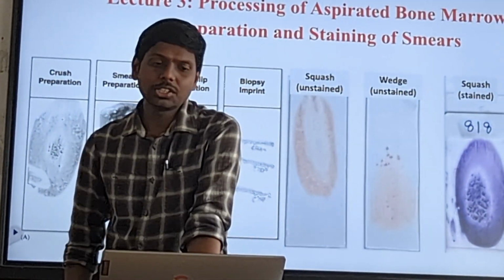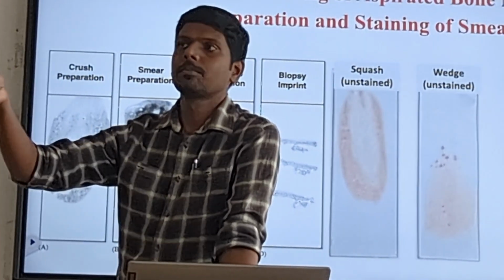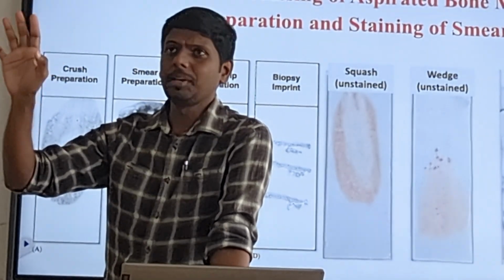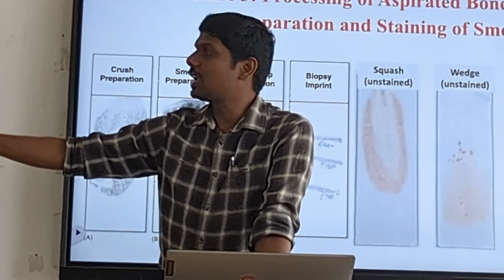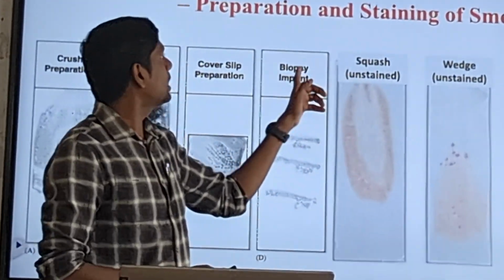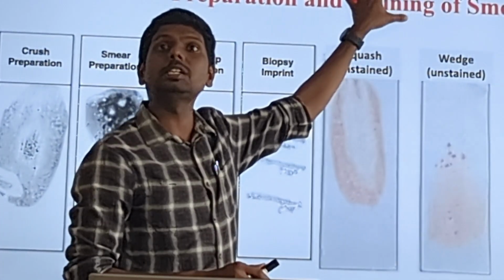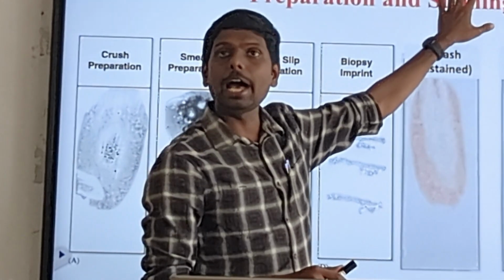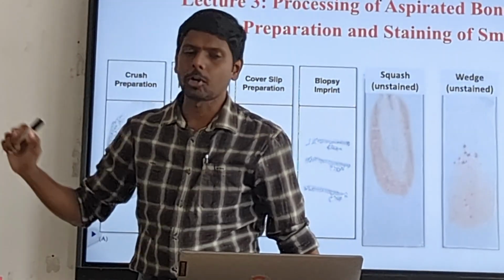Then in the third lecture, we discussed processing of the sample for the purpose of aspiration. Let me be clear: processing for only aspiration, not biopsy. In today's lecture, I will discuss bone marrow biopsy processing. In the last lecture, we discussed processing of the aspirate. So don't confuse aspirate processing with marrow processing. Biopsy processing, I mean.